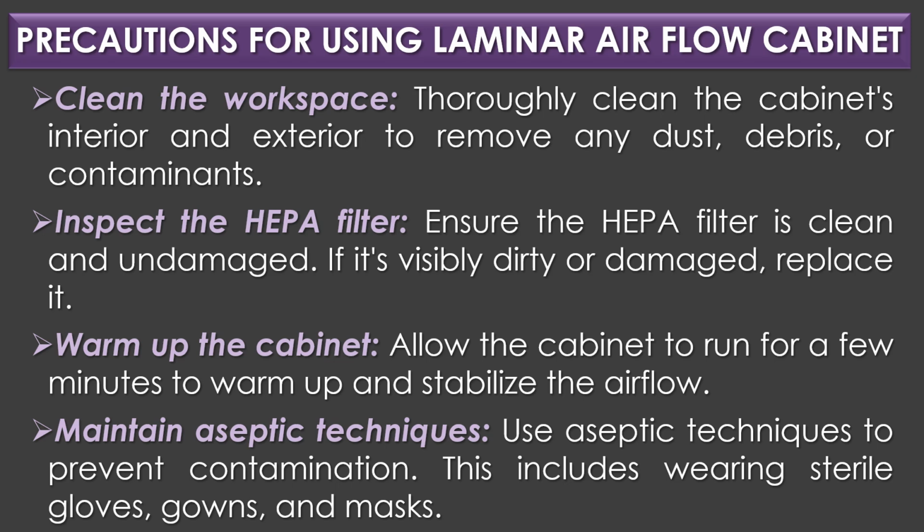Warm up the cabinet. Allow the cabinet to run for a few minutes to warm up and stabilize the airflow. Maintain aseptic techniques. Always use aseptic techniques to prevent contamination. This includes wearing sterile gloves, gowns, and masks.